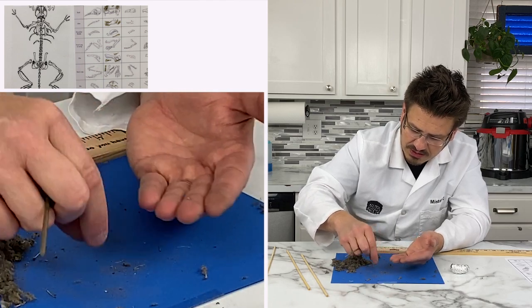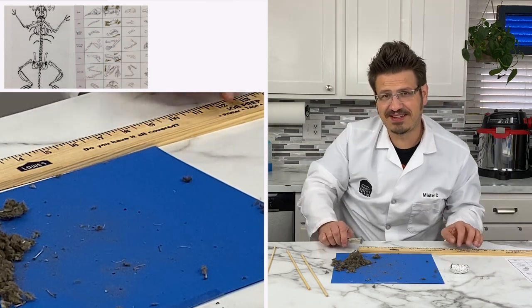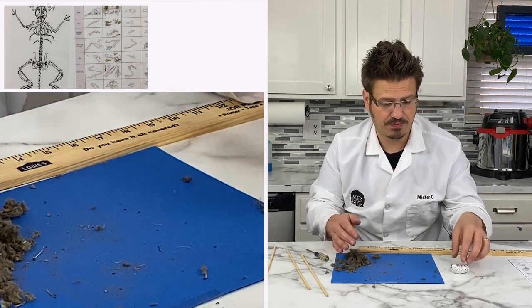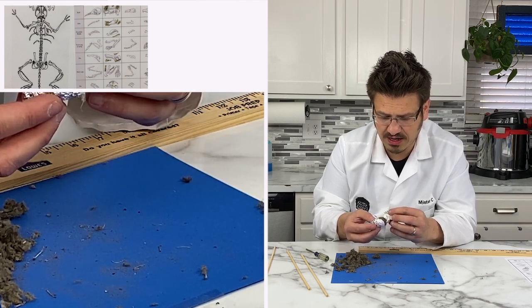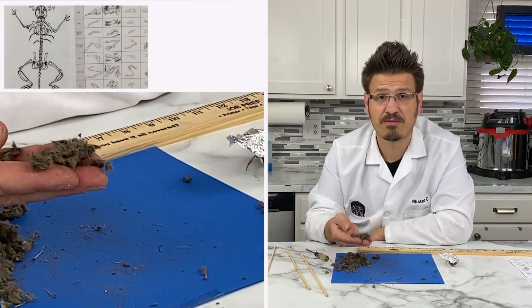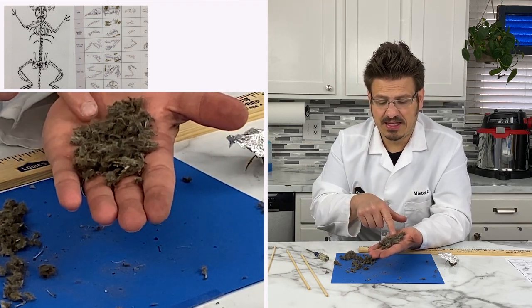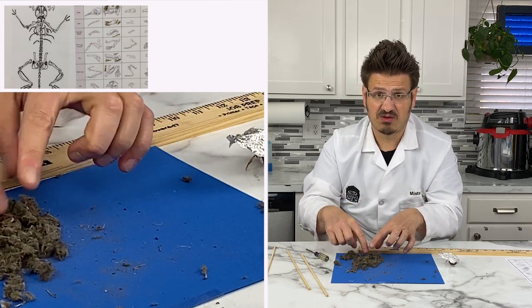All right, we've got a question. What's the question? Benjamin wants to know what all that fuzzy stuff is. Is it feathers, fur? How is it a ball of that stuff? All right, Benjamin, that is a fantastic question. I'm going to repeat the question just so everybody can hear it. The question was, what is all of this stuff and how is it like a ball? All right, so I'm going to open this. I'm not going to take this one apart. Whoa, what is that? Okay, I want to, but I'm not going to take it apart. So all of this is fur from the mouse that the owl ate. I'll hold it right here so you can see it all. That is fur from the mouse that the owl ate. When the mouse goes into the owl's belly, the owl can't digest the fur. So the stomach of the owl is squeezing and squeezing and squeezing the remains of the mouse.